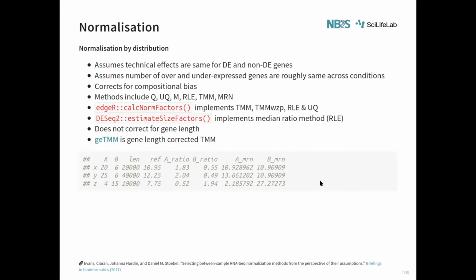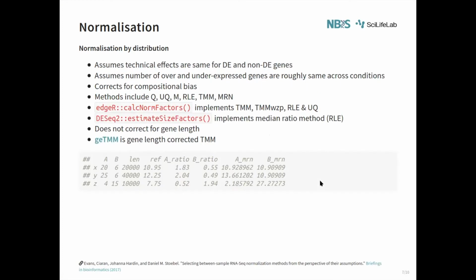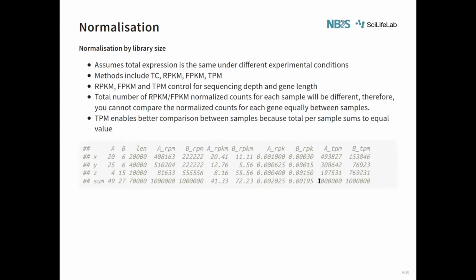Questions? I have one question, if I may ask. Yes, please do. You said that with FPKM you cannot directly compare, so I cannot claim that gene X is differently expressed than gene Y. Do I understand it well? Well, you cannot say anything about differential expression. You can just say, yeah, it's different. Okay. Thank you.